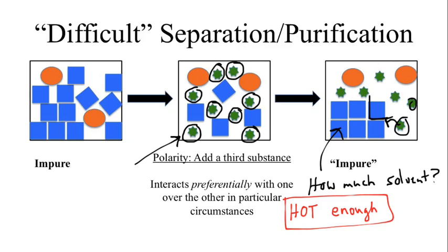So it needs to be a slow process. Slowly add the solvent, let it dissolve a little bit. If it doesn't look like it's dissolving, add a little bit more, until eventually you decide, oh, it's all dissolved. Take it off the heat and let it cool down. I know that's a bit frustrating. It's not a hard and fast answer, but that's the way recrystallization works.